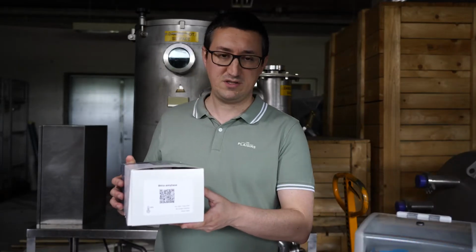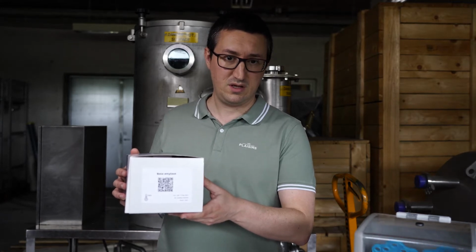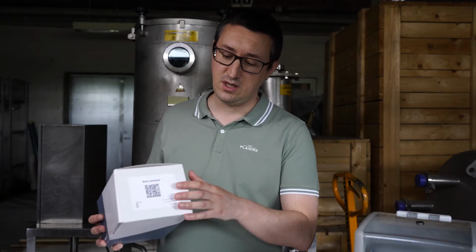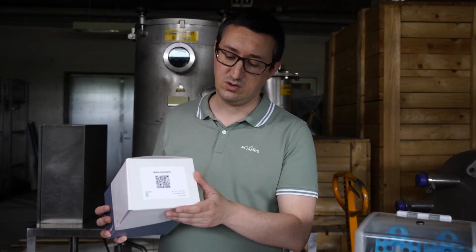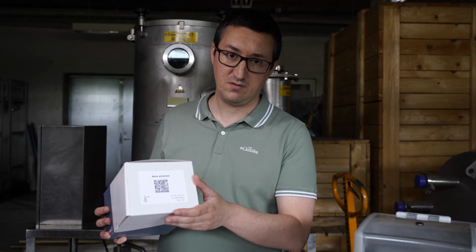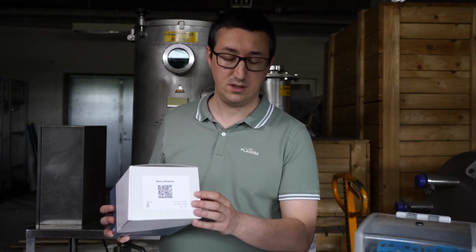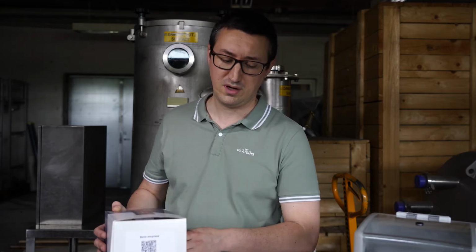Hi there. So today I'm going to explain how to run our beta amylase assay for malt. Here we have a 6-pack that we have sent you, which contains 6 beta amylase kits, and you can see here the QR code that you will use specifically for this kit, and you can also read that there's a beta amylase kit in this QR code part.